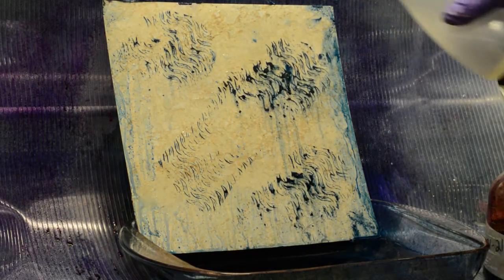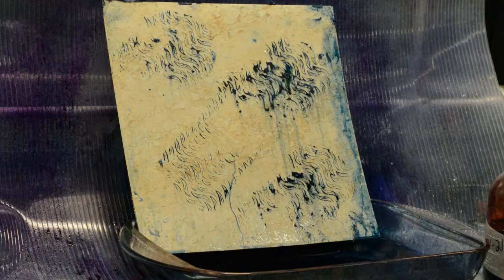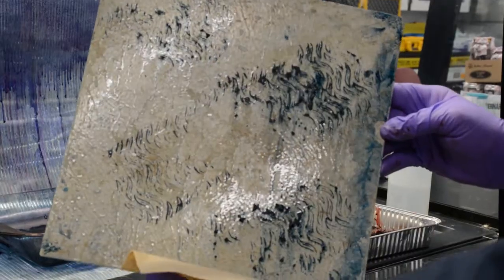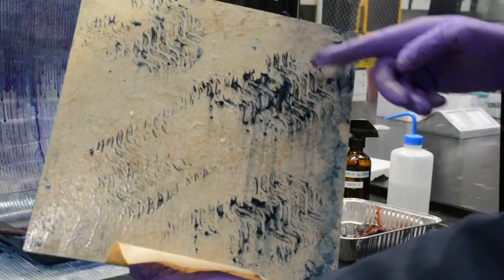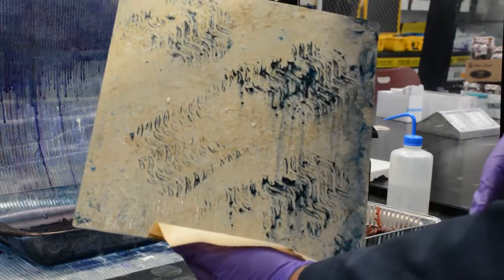And the options here are basically personal preference and contrast more than anything else. Both are very effective, both are accepted methods between the Amido Black and the Hungarian red. As I noted before, you can see where the overdevelopment is from the blood itself. It only intensifies it with the Amido Black. It's in the fainter areas where it excels.